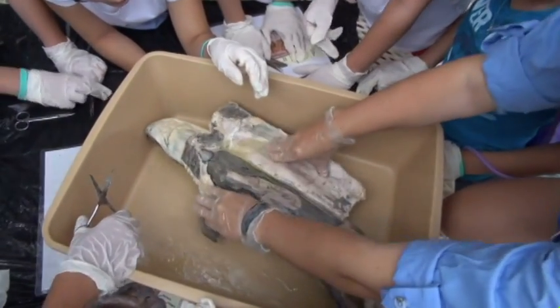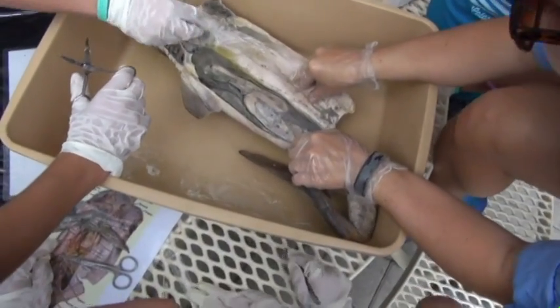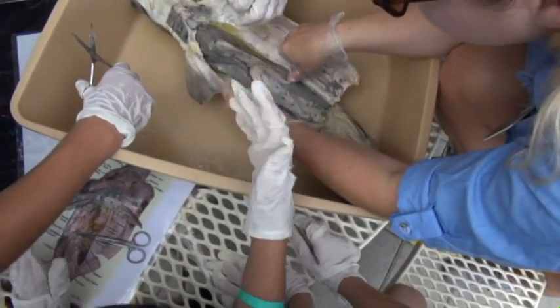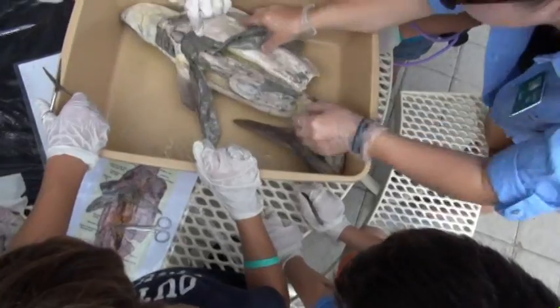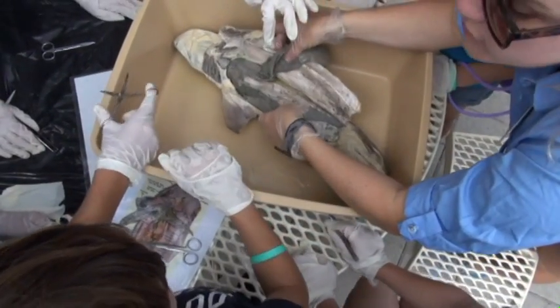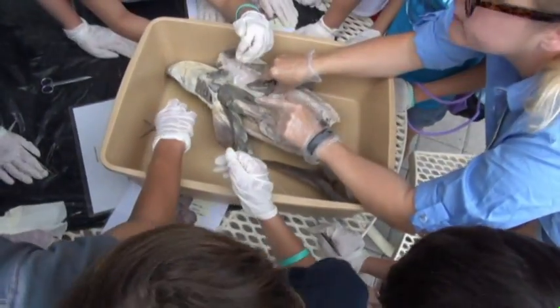Let's find the oil. Who remembers where the oil's coming from? What organ? Liver. The liver. Very good. Now, is this the liver? It is. I was going to ask you guys to try and find it. Looks like we accidentally cut a little bit of our liver, but that's cool. Let's see how big this guy is. That's the liver, right? Yeah, this is our liver. So look at your diagram. How many pieces of a liver are there for our shark? Three, because there's a median, a left, and a right lobe.